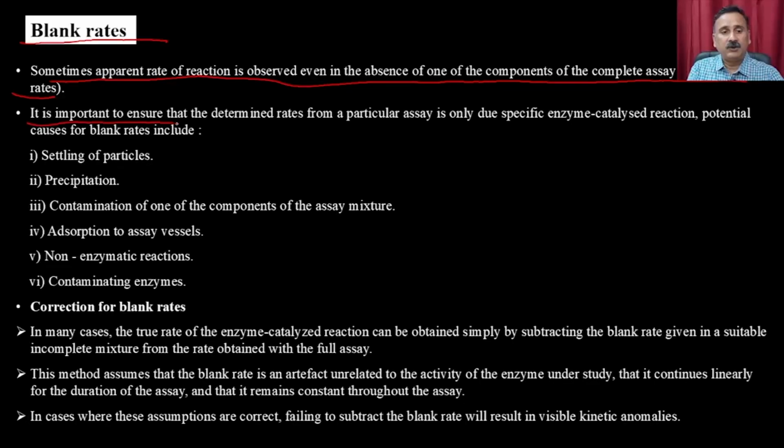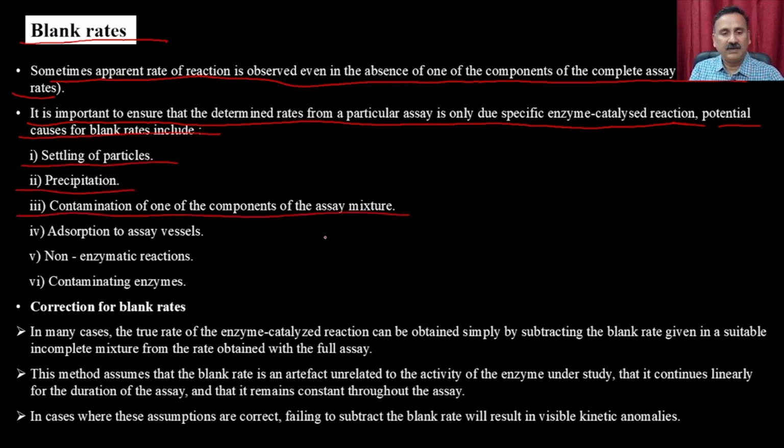So it is important to ensure that the determined rates from a particular assay are only due to the specific enzyme catalyzed reactions. Potential causes for the blank rates include settling of particles, precipitations, contamination of one of the components of the assay mixture, adsorption to the assay vessels, and non-enzymatic reactions. So this is the non-enzymatic reaction blank I am talking about, or some contaminating enzymes. Those are also going to be responsible.